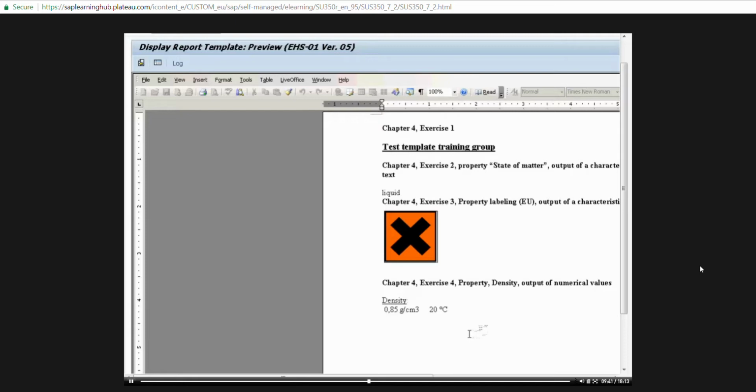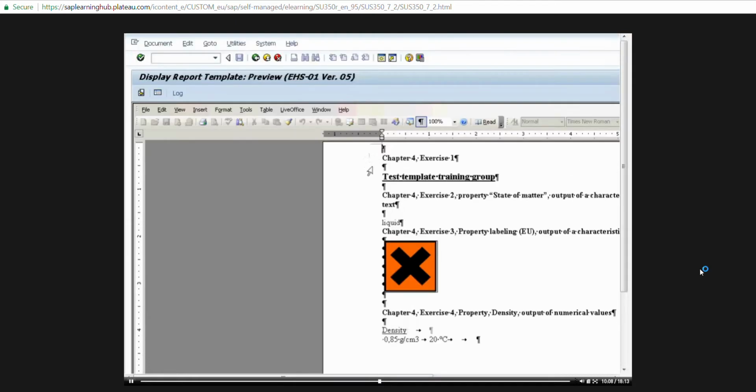We will need to add data in the specification, in the property density, in such a way that the characteristic data for accuracy, pressure, and method appear on the report. We will first do some additional formatting to the template. Let's toggle back to the report template.